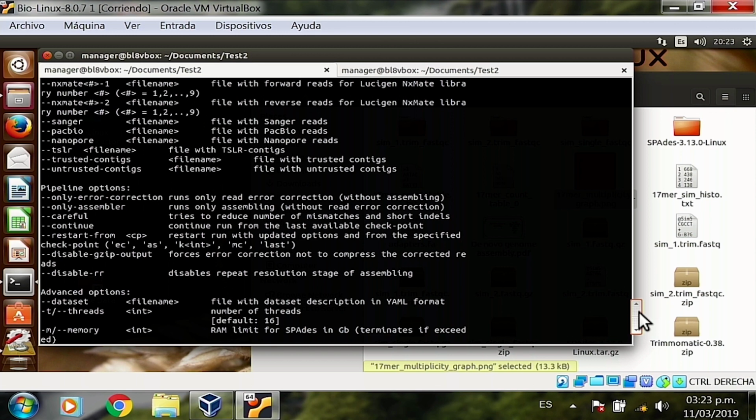are contiguous. If for some reason your assembly was interrupted at some point, a power outage, your battery died, your computer died because of RAM, the cluster you were running it in just had a major power failure and it just killed everything, then you can always use a restart or resume. Restart-from will tell you from which stage you want to restart it. From error correction, from assembly the first k-mer, from assembling the second, the third, the fourth iteration, etc.